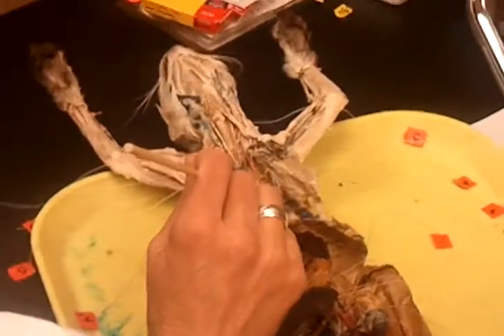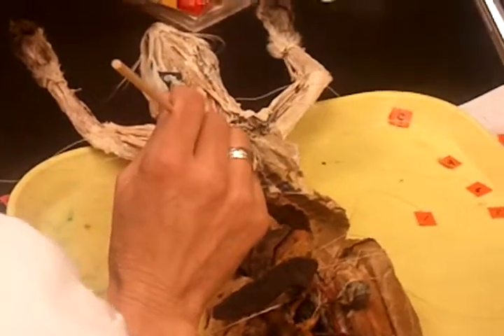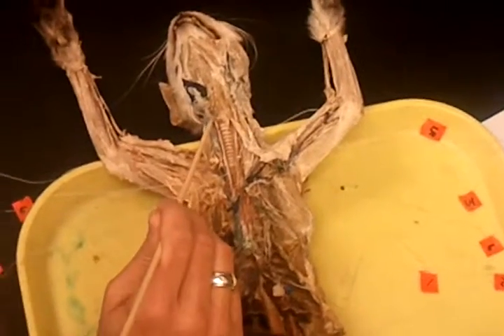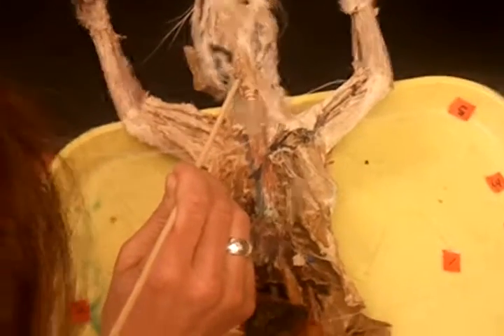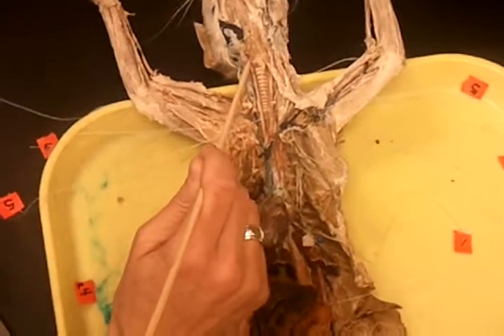Again, coming back, our brachiocephalic artery. Now we're going to tackle the second artery coming off. This one is called the right common carotid artery. On your list, that's number 5. Up here, close to the skull, the right common carotid artery will split into the right internal and right external. We're not looking for the split on the cat.